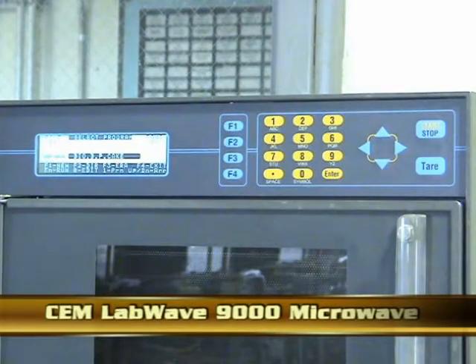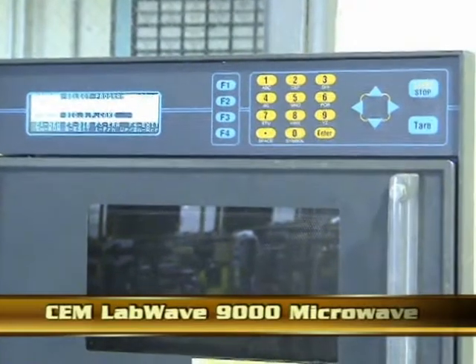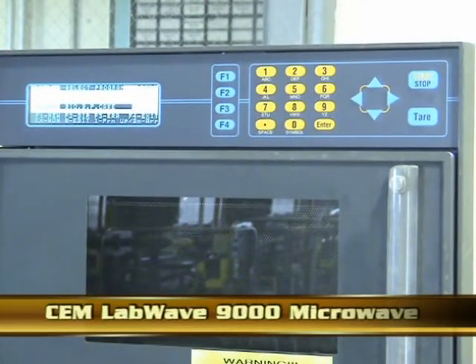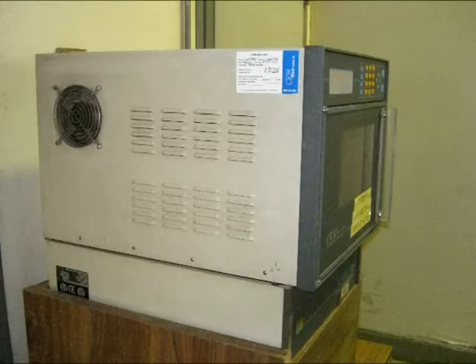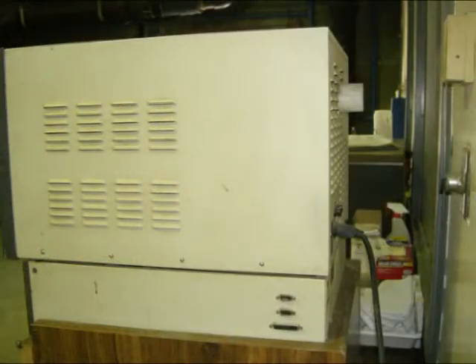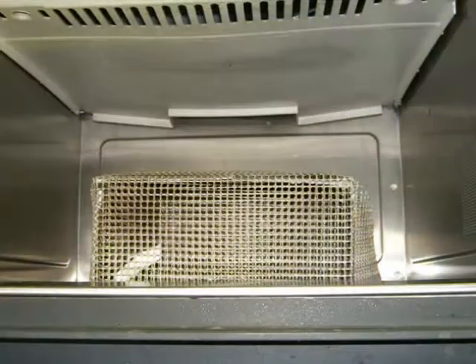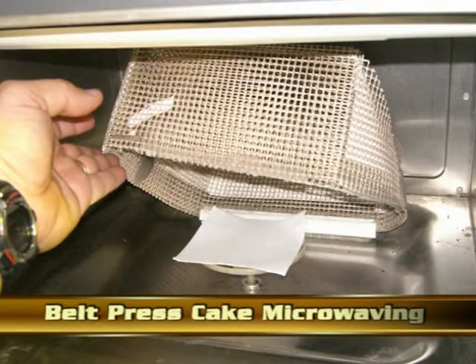The CEM LabWave 9000 Microwave is basically a typical microwave, but with additional features. One of the additional features is an extensive exhaust system. The exhaust fans displace any gases created by the cooking process within the microwave. In addition to the exhaust fans, the microwave has an internal balance that is utilized to weigh the solids that are being microwaved.